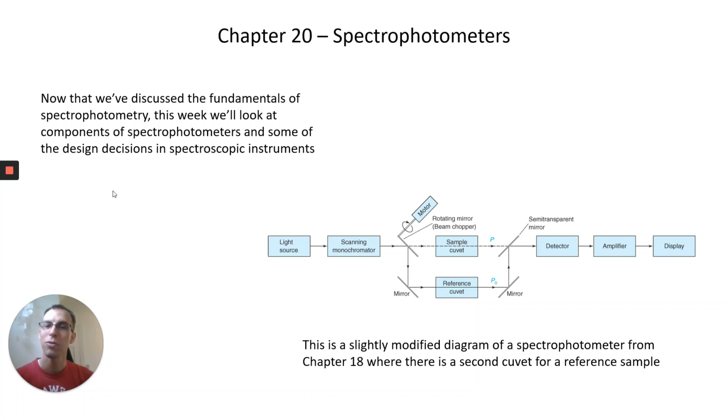And so just think of this as a specific deep dive into spectrophotometers, but I hope what you're able to get out of this is the general idea and sense that these techniques that we use require a lot of work to be able to construct something, and a lot of decisions that need to be made, different types of materials that we can use. And so we're going to do this with one specific type of analytical technique and application here with spectrophotometers, but we could do the same thing for many others.